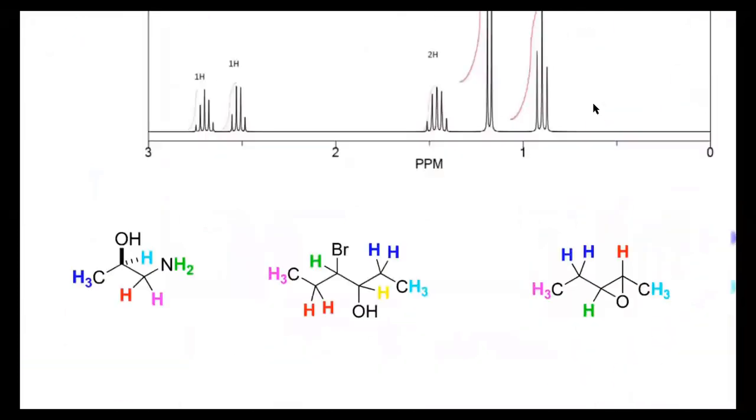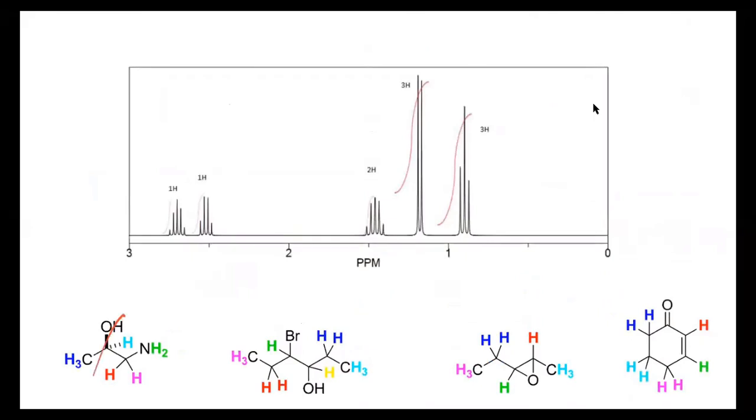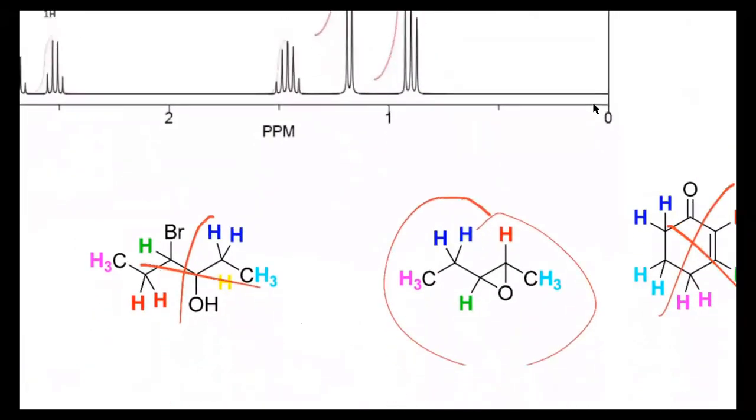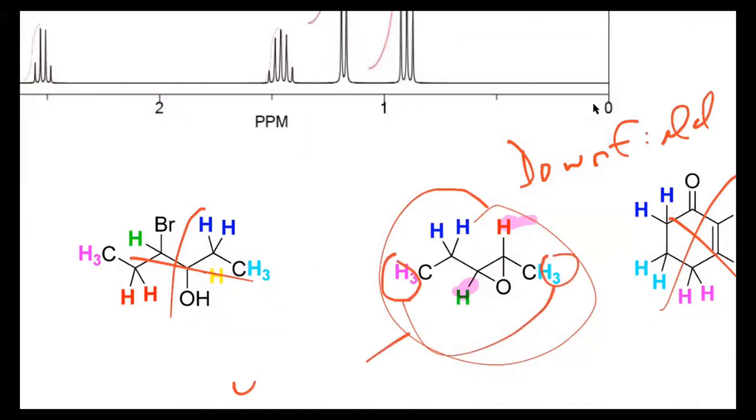All right. So here we can rule out what we ruled out already. We ruled this out, we ruled this out, and we ruled that out. Is that right? So working with this one, we said that the 2 protons here should be the furthest downfield, and then the 2 methyl groups are going to be upfield.